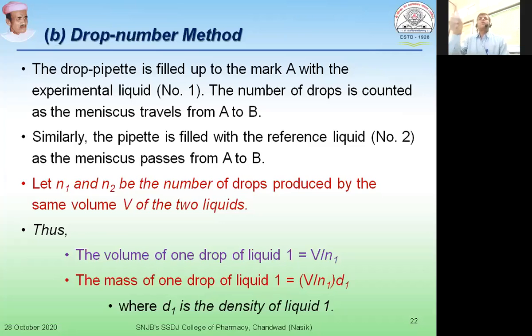To have the volume of both the liquids remain constant, because this factor is going to be nullified from the equation, we have to ensure that we use the same stalagmometer for counting the number of drops of the experimental as well as the reference liquid.